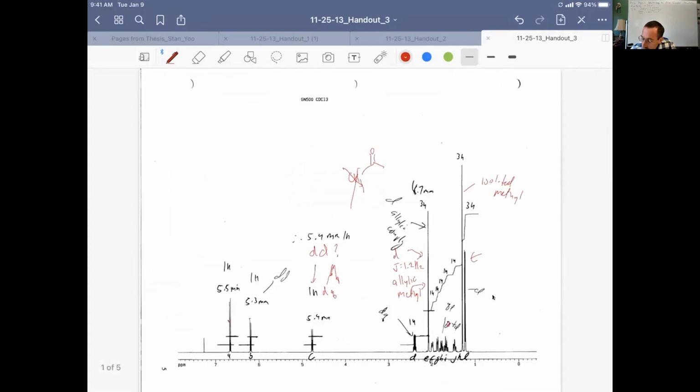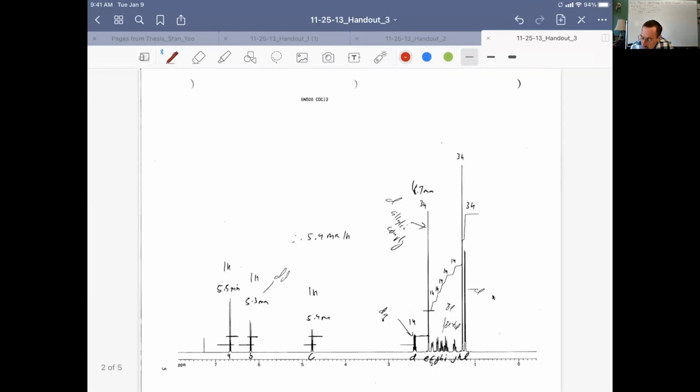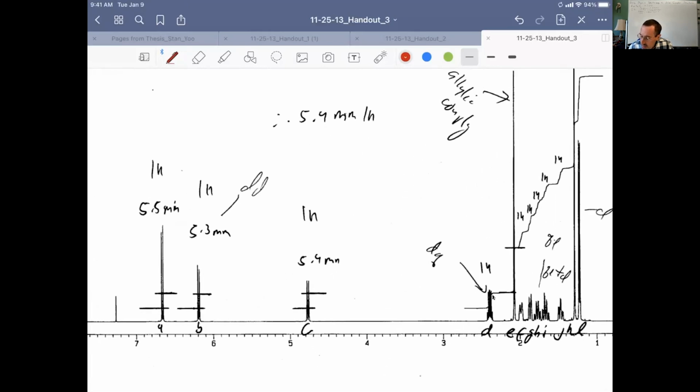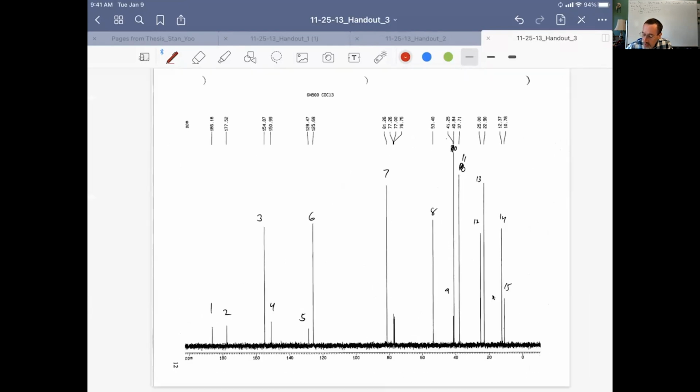Let's see what happened here. Did I have this thing duplicated? Okay, oh yeah, so that's what I did. I went through and labeled my peaks A, B, C, D, E, F, G, H, I, J, K, L. If I had later discovered another peak hiding under one, or a shoulder, and I realized I can parse that out into 2 peaks, I might have called something like G and G prime. But here every resonance really was quite well resolved, so I was able to get it all the way at once.